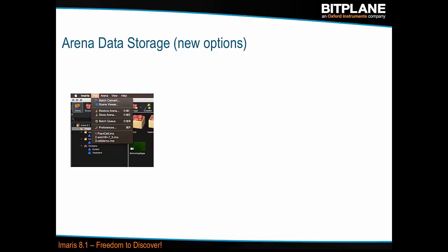But we realize that's the situation with Imaris 8.0. We realize that this causes some trouble, because after a little while, you may need to move the data. You may need to collaborate with somebody who is far away. And because of that, we introduced a couple of functions.